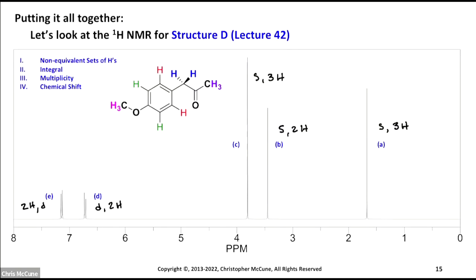So here we go. We've got a ketone here, and so there's the alpha carbon, right? So those should show up around 2 ppm, give or take a little bit. Depending on what else is around, here we've got a proton that's roughly around 2 or so. That looks pretty good for peak A. It's close to that 2 mark. So I'm going to call that singlet A.